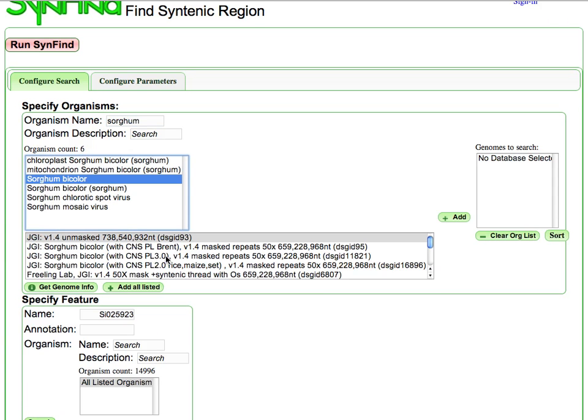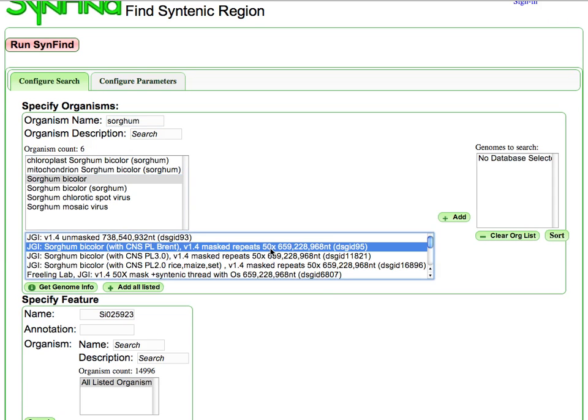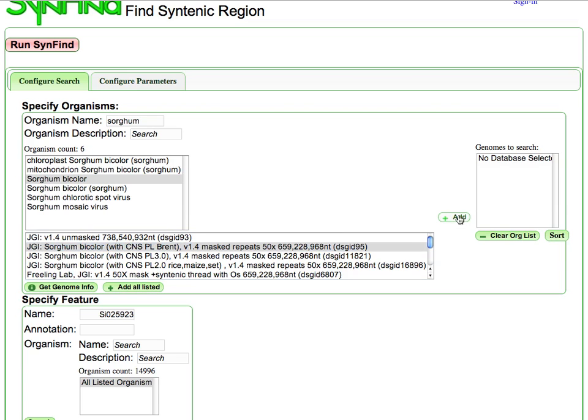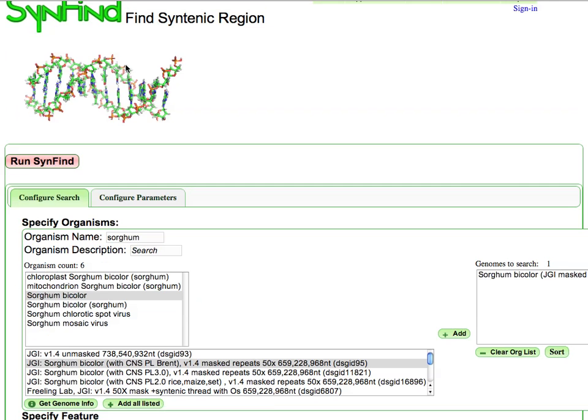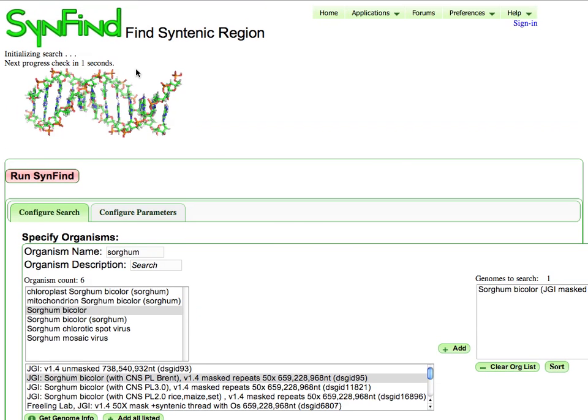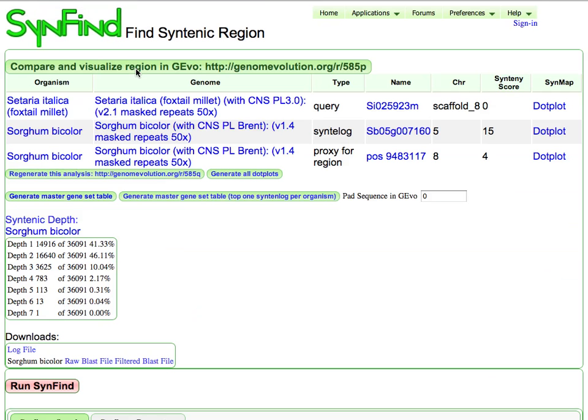And here, if I wanted to, I can continue to add in many more genomes on this front. And what I can do now is once I have this search set up is I just go ahead and hit run.